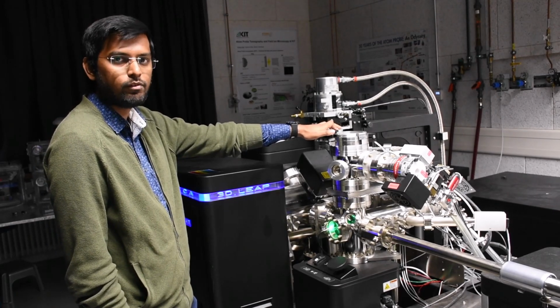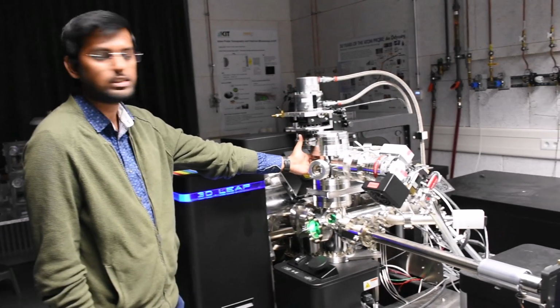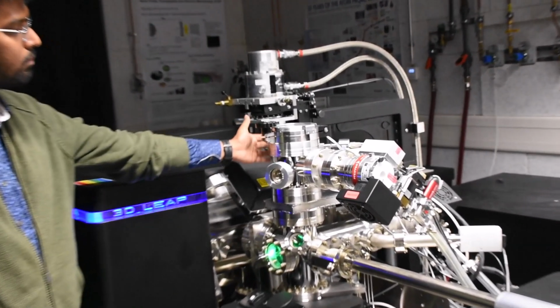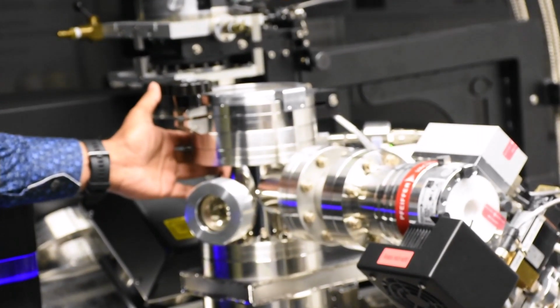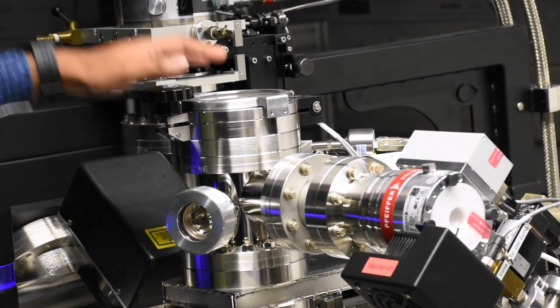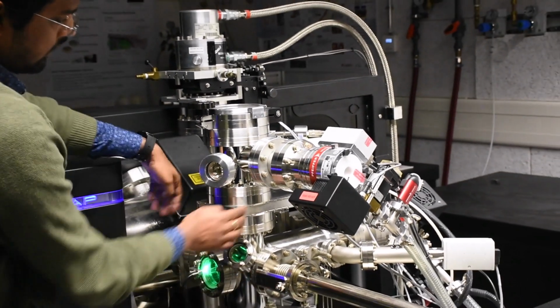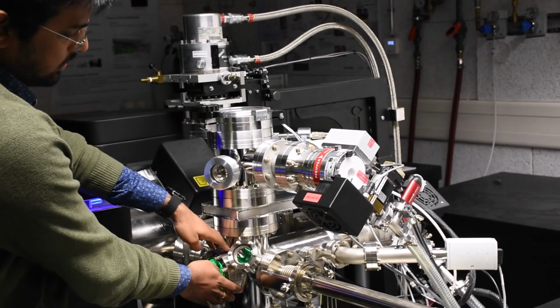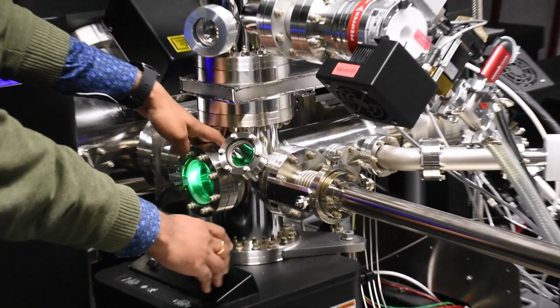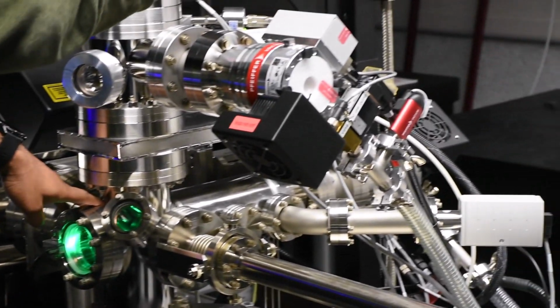So this is the load lock of our local electrode atom probe. This is the version LEAP 4000XHR from Cameca. And the load lock is the only chamber of our atom probe which sees the atmospheric pressure. And then it is pumped to pressures of 10^-6 to 10^-7 torr using this turbo pump. This chamber is separated from the buffer chamber, which is here, with this particular valve. And the buffer chamber is usually at pressures of 10^-8 to 10^-10 torr, and it is pumped by a pump which is on the back side.